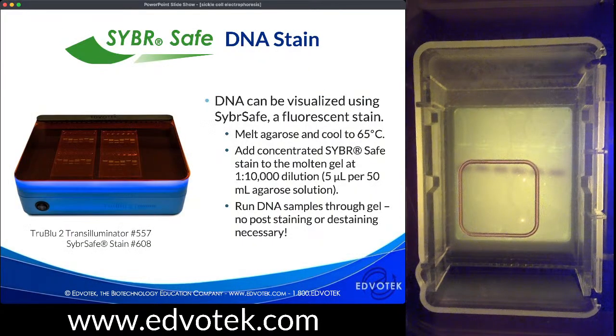So SYBR Safe is a fluorescent dye that binds to DNA. We add it to the gel and it stains the DNA while the gel is running, which means we don't have to spend a lot of time staining the gel after running it. Each DNA molecule is decorated with the SYBR Safe, which we visualize by exciting it with blue light. It's very sensitive because each excited dye molecule can emit a lot of light. And so this is an amplification effect, which allows us to visualize the smallest bands of DNA.